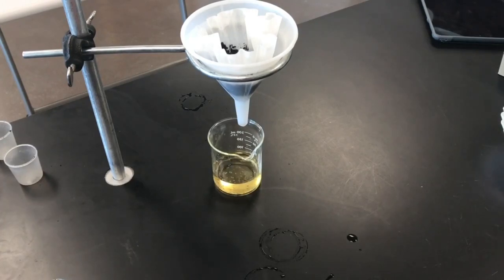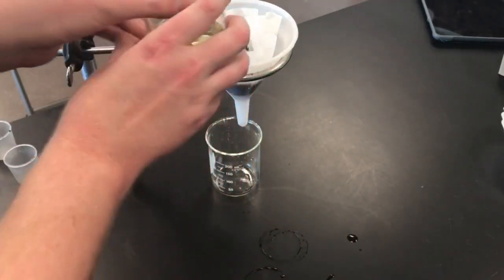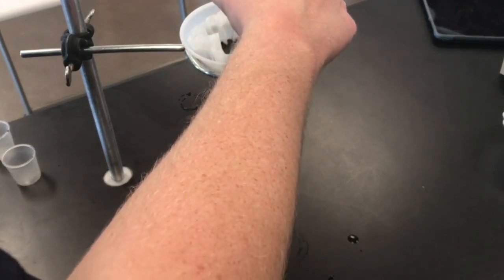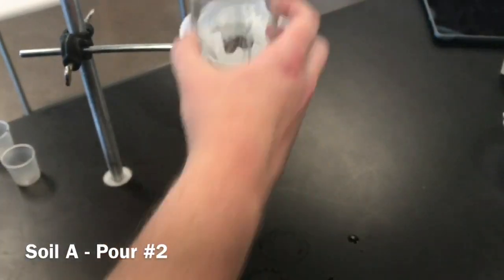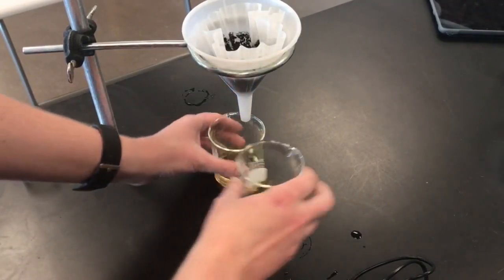So all I'm going to do, once it's ran through a decent amount, I'm just going to replace my beakers, and I'm going to pour it through again. So you're going to want to do this 3 times for soil A, 3 times for soil B here. Okay, so I'm going to filter this out a 3rd and final time here. Switch your beakers out.